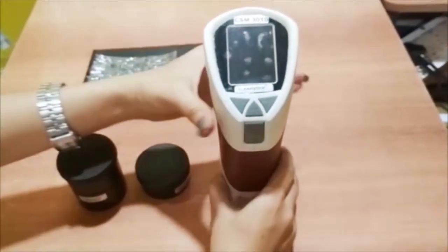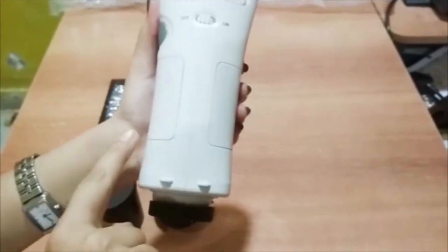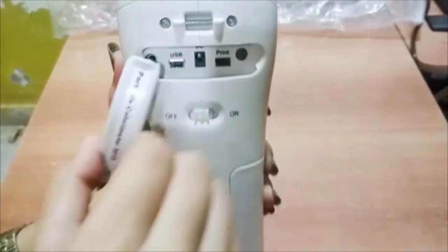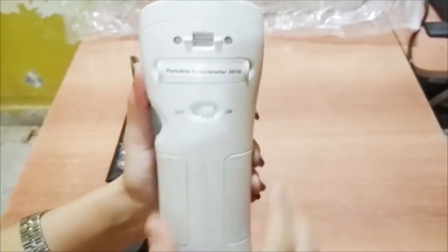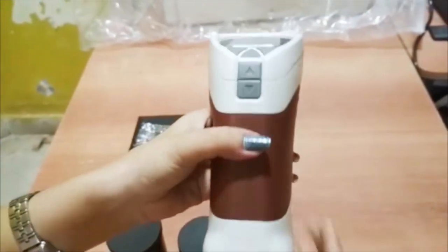Portable Colorimeter 3010 — we can detect the color of material with this instrument. It consists of batteries. This is the USB and printer port. The power on/off button and the test button is for measuring the parameters.